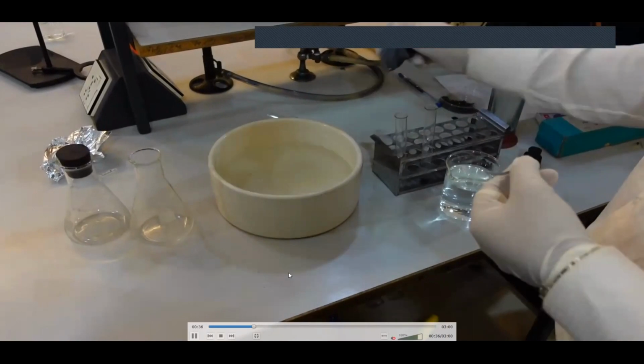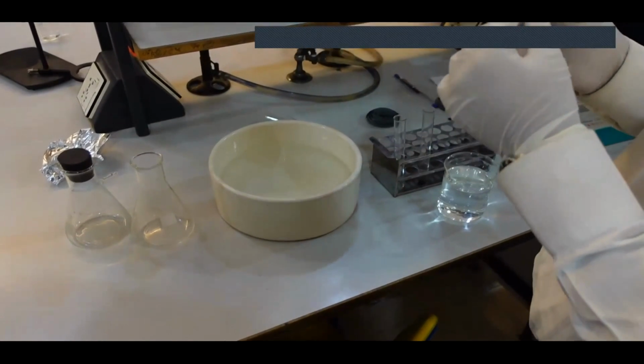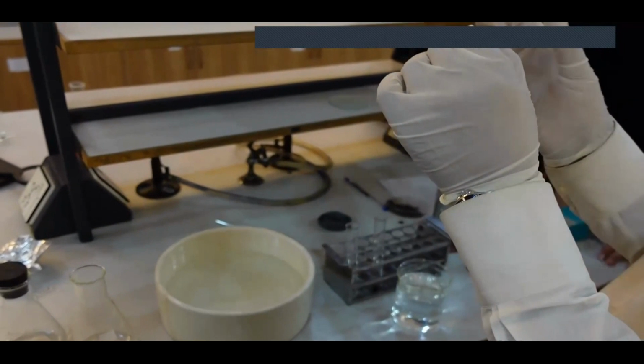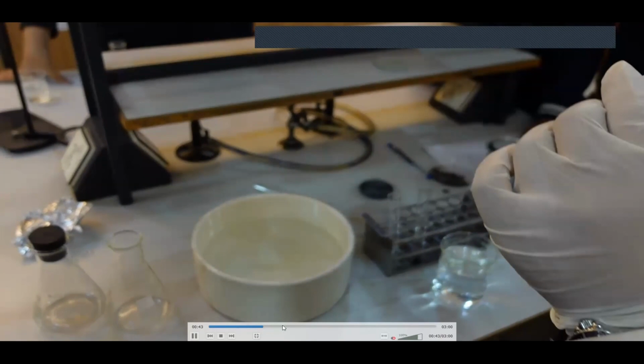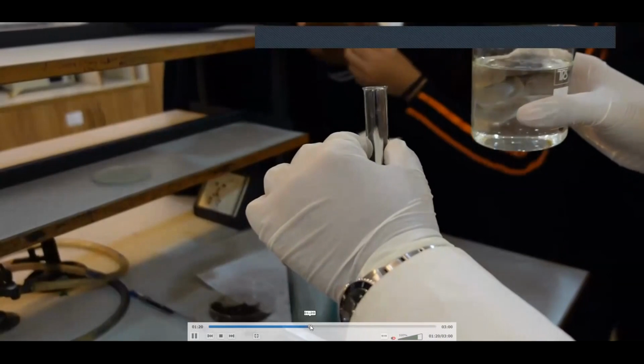Now this one is magnesium. That was copper, by the way. This one is magnesium. Okay, see, so I added magnesium there. And okay, here you go.